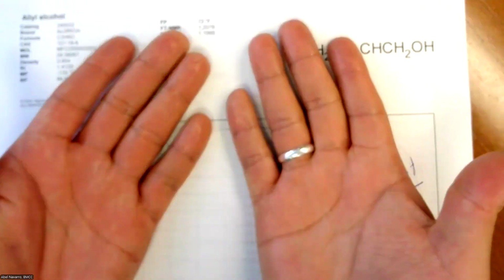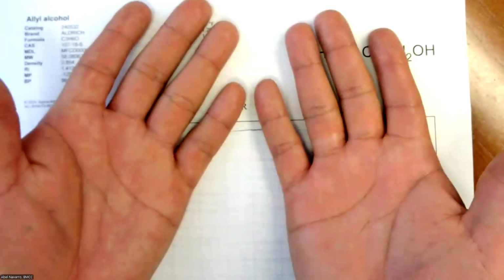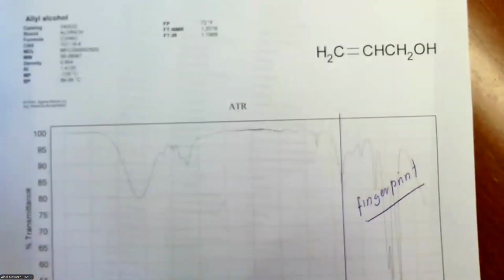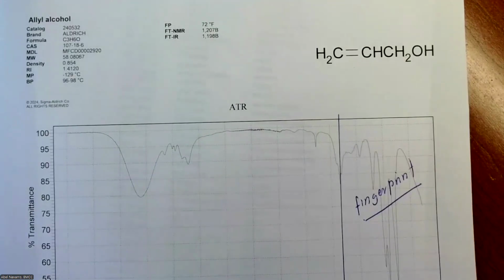So a pair of enantiomers, they should have, well, in this case, they're not enantiomers. So these two enantiomers, they have the same fingerprint region. Okay, so they're identical. The fingerprint should match. Okay. All right, so let's go back to the slide.